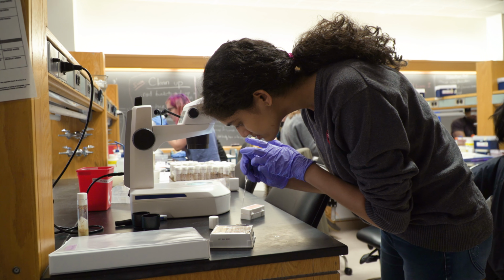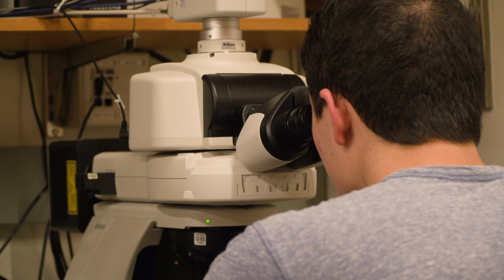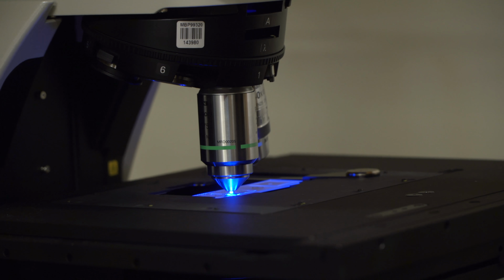They're doing what's called immunofluorescence, where they're tagging certain proteins, and then they're using a microscope called a confocal microscope so that they can visualize the stains that they're looking at.